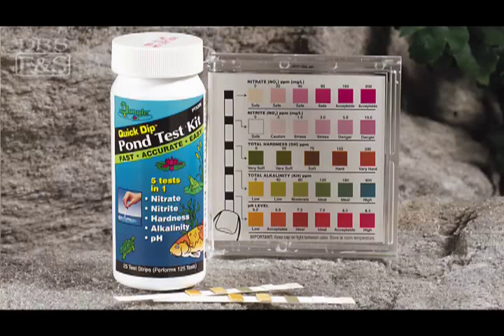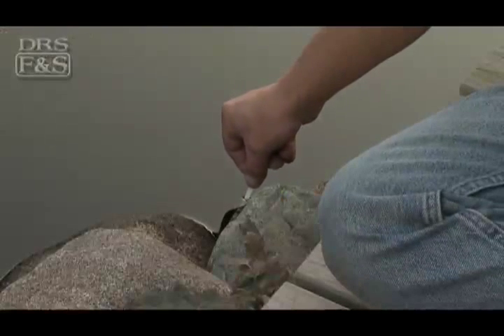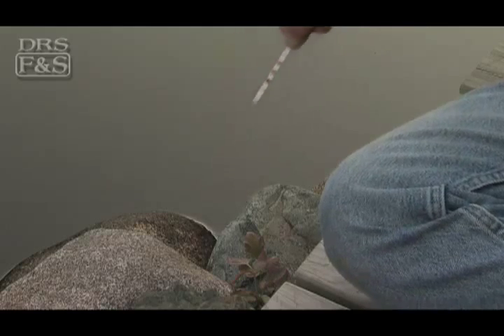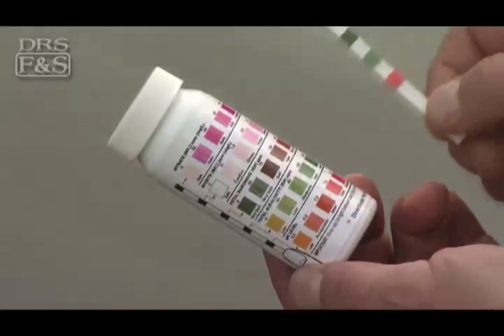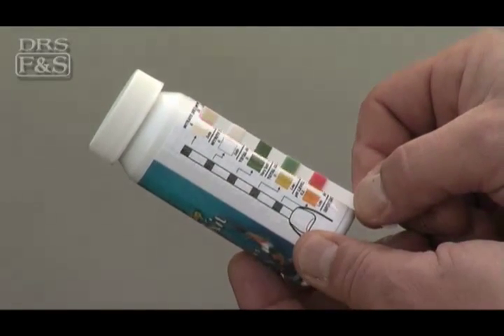Testing with a dip strip is even easier and perfect for daily monitoring. Simply dip the strip into the pond water, wait for the color to develop, and match the color on the strip against the color chart included on the label of the test kit.